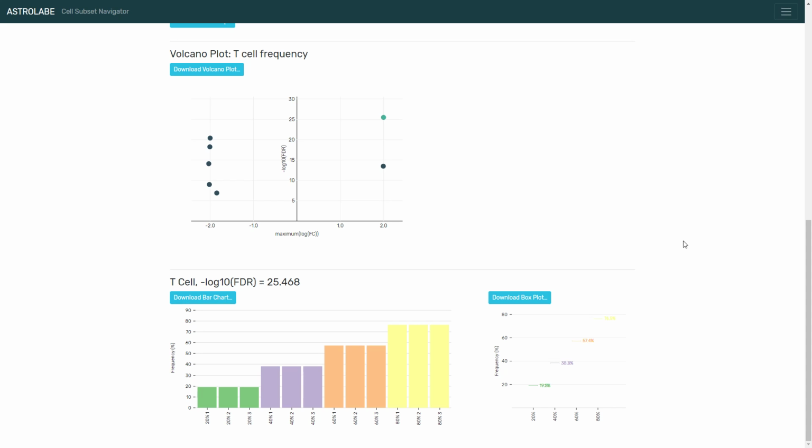So again, this is a toy example, and this is something that is very easy for the platform to do. With that said, we do use these benchmarks on a regular basis to make sure that Astrolabe gives researchers the kind of answers that they're looking for.